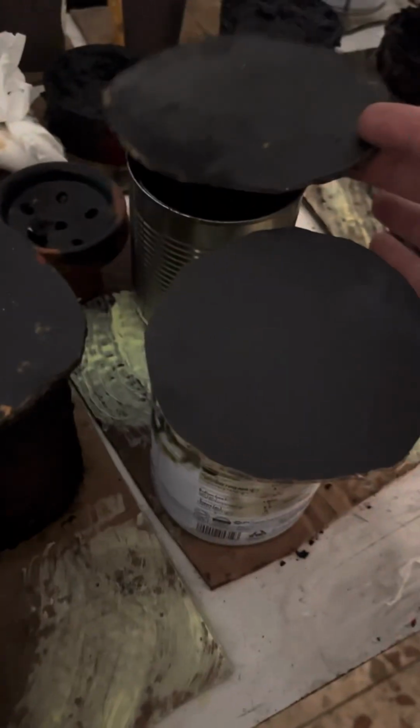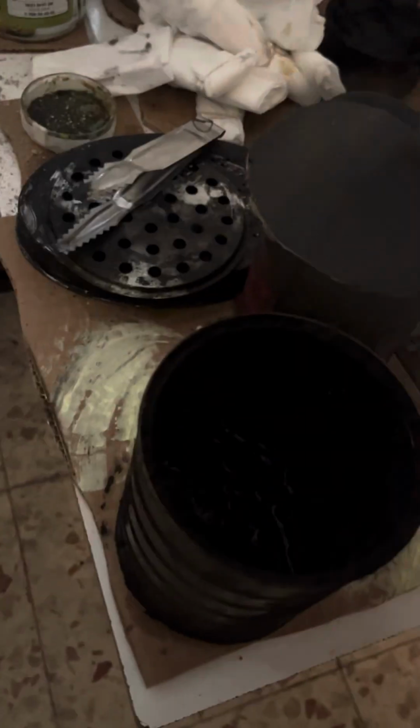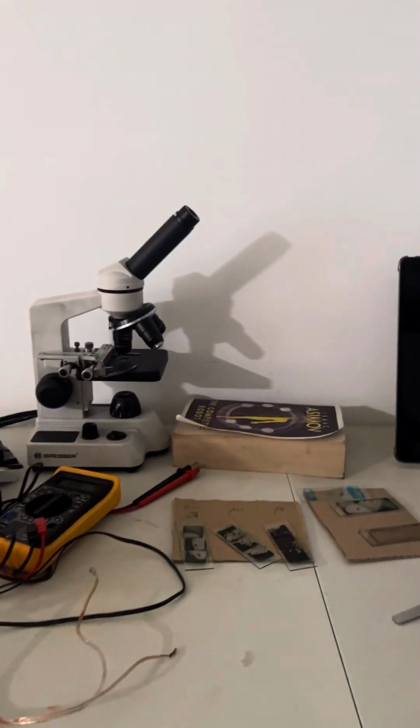This is where most of the new material was supposed to be, because it was before the reduction, but all the life form, because we created life form, and the two other crucibles on the top. So I've taken one from this pair, one from that pair, and one from the upper one. We'll take a look at the end. Already several hours have passed, maybe 2 hours since I've taken the samples, but it shouldn't be of great difference.